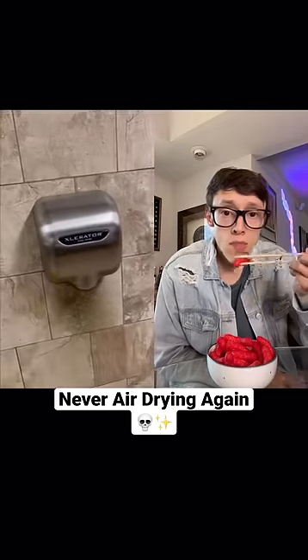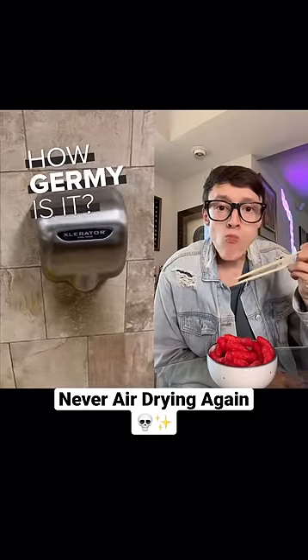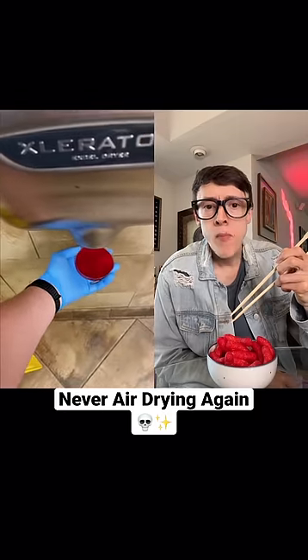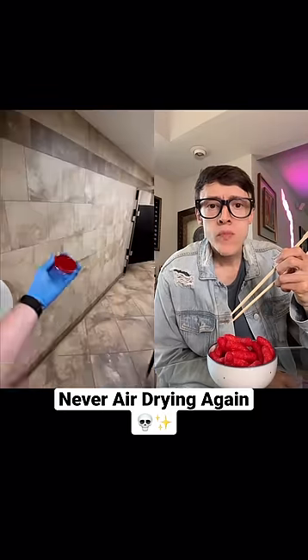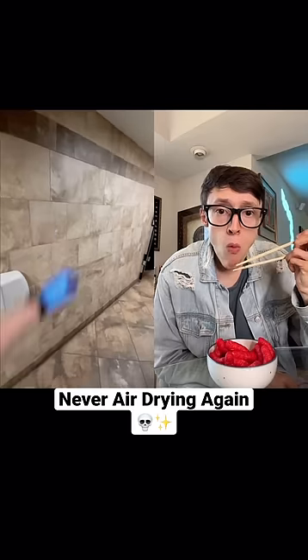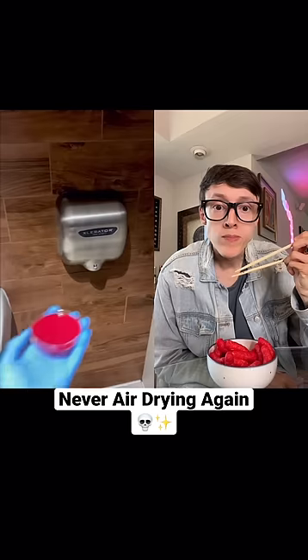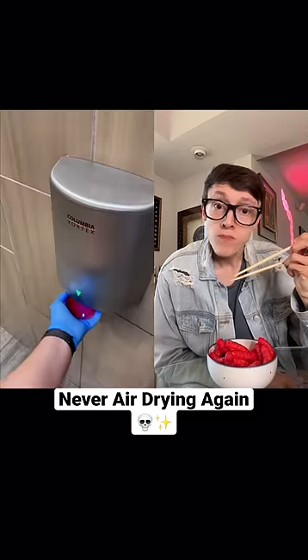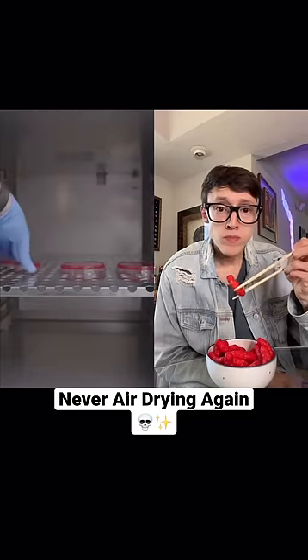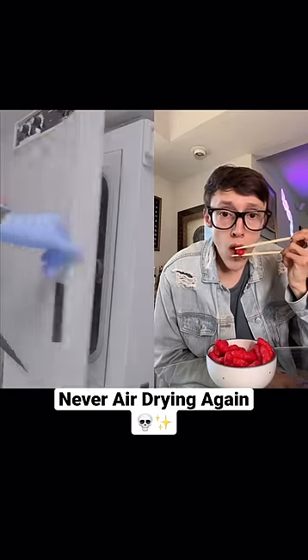We're heading back to hand air dryers for this episode of 'How Germy Is It?' After seeing the results from last time, I wanted to do this experiment again and add one control to simulate shaking my hands dry. Then I went to a couple more locations to solidify my findings and put them all in an incubator to grow. Let's see what we found out.